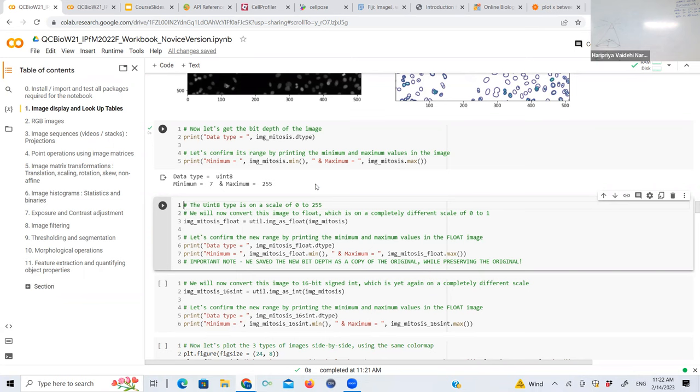That's all it is. The other thing I told you can do is pull out the minimum pixel value and the maximum pixel value. So you can see that your dimmest pixel has an intensity of 7 and the brightest pixel is at 255.